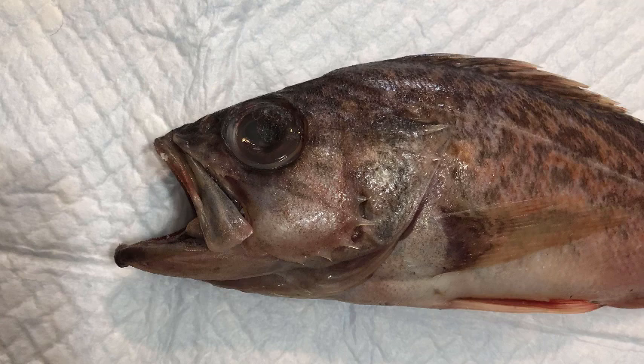We'll start by looking at the anatomy of the head, specifically the mouth and gills as they relate to the fish's eating and breathing. How does a fish eat without swallowing a ton of water with every meal? For most fishes, they capture their prey by sucking in a large volume of water including their prey. Their mouths and head anatomy are oddly dynamic — using specialized facial musculature they create negative pressure in their mouth cavity, and by opening their mouth suddenly they basically slurp up anything in the water in front of them. Once the prey is inside, the walls of the mouth cavity squeeze in, pressing the water out through the gill openings. Hard gill rakers create a colander-like basket trapping food inside so the fish can swallow it without a ton of water. We'll pay special attention to the gill rakers because they can tell us what kind of food the fish habitually eats.